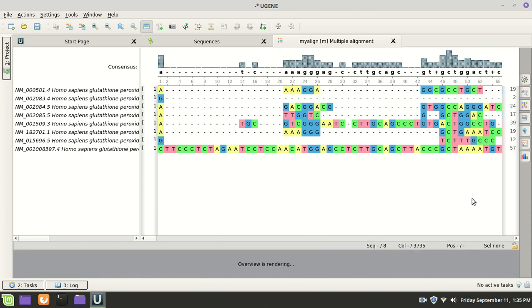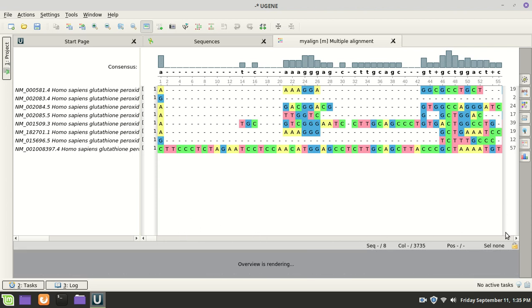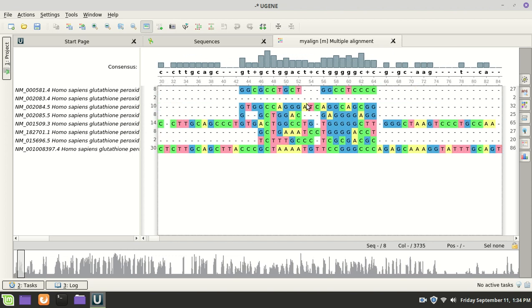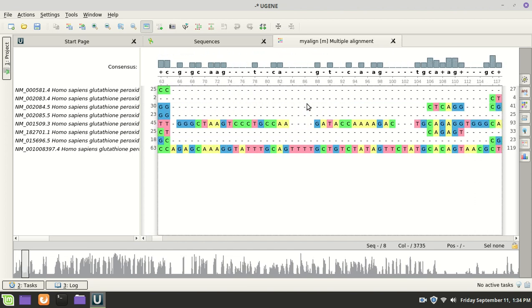These are not always accurate at all with a longer sequence. You're probably 30 or 40 is as far as you can go and believe it. You know, this one, I don't know if I would believe this or not. They really aren't. These programs really aren't very good. Dot plot is your best bet to find something.